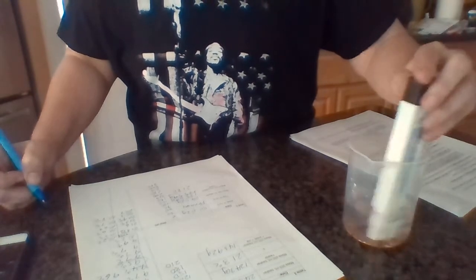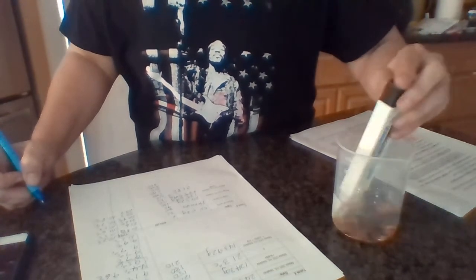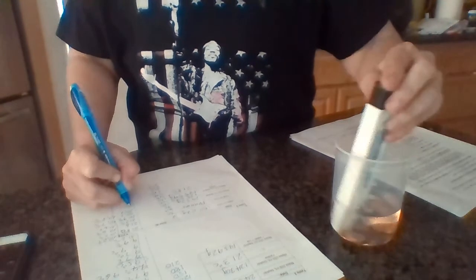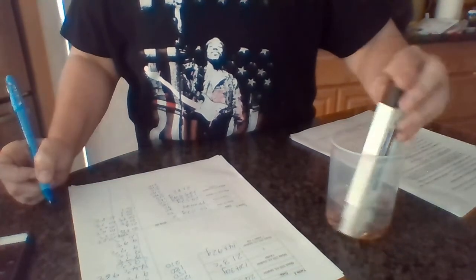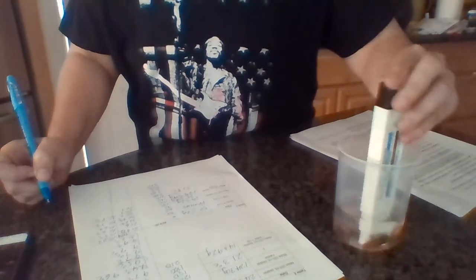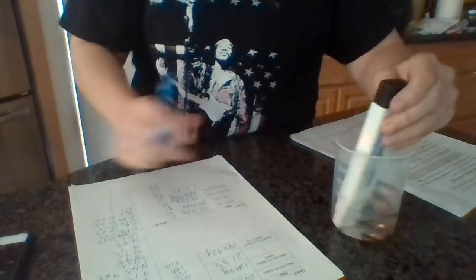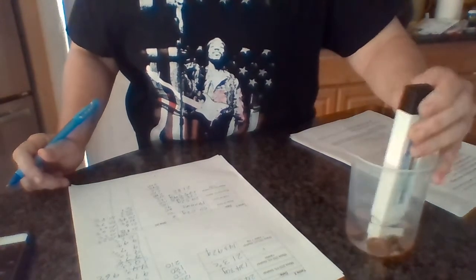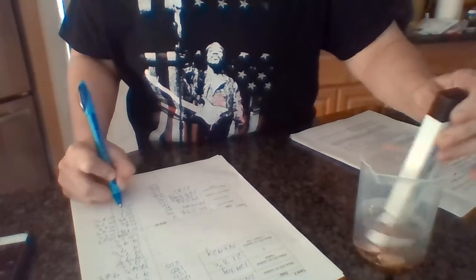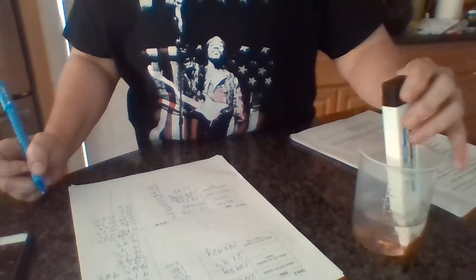I had these pennies in my freezer for at least 2 hours. I did parts A and B, did some calculations, took a break. I'll take another reading, so we're still at 20.7. It's been 3 minutes now, but I want to go beyond the 3 minutes because I want to make sure that this is the minimum. It's turned off, so I'm going to turn this back on. We're actually still going down because now it is 20.6. We're at about 3.5 minutes so far.